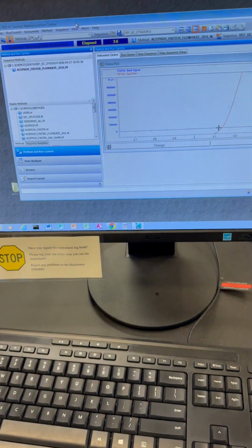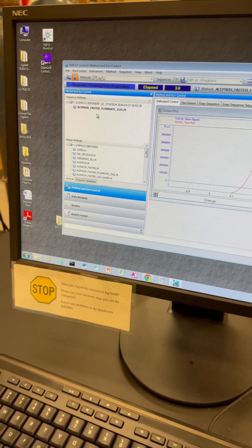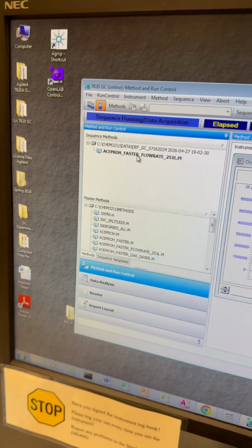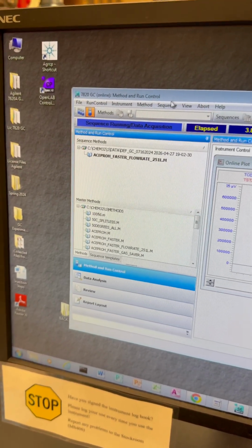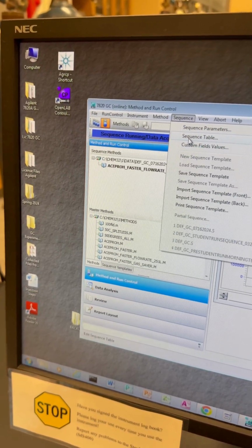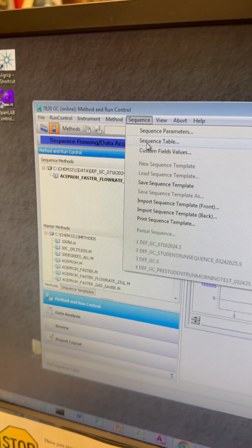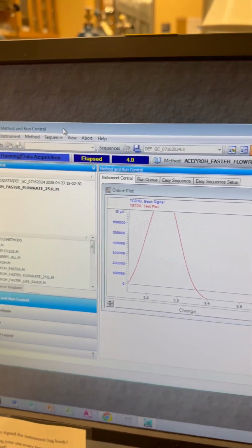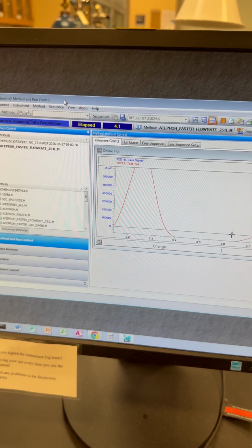And then you're going to come here and again in the same one, pick the correct flow rate that you like, that you see works best. When you go to edit entire method, then you're going to pick the correct one. Then you're going to go to sequence table, add the name and initials of those 9 samples, and you're going to click run, and it's going to go. So that would be the second.